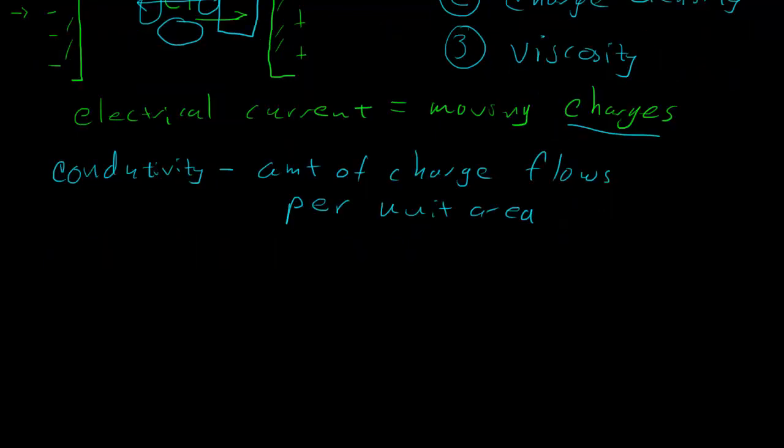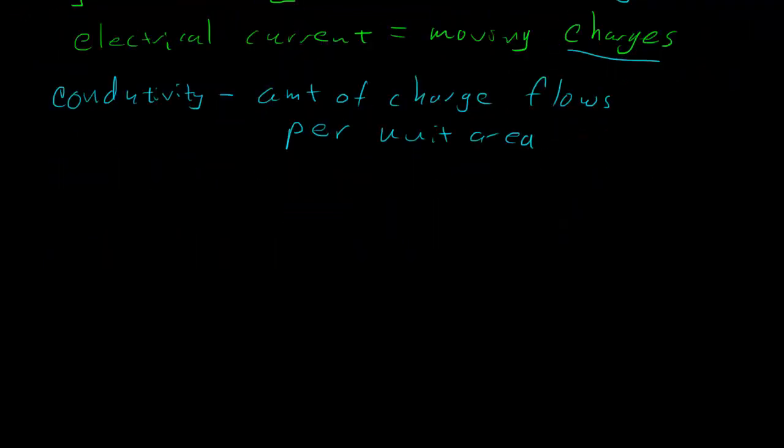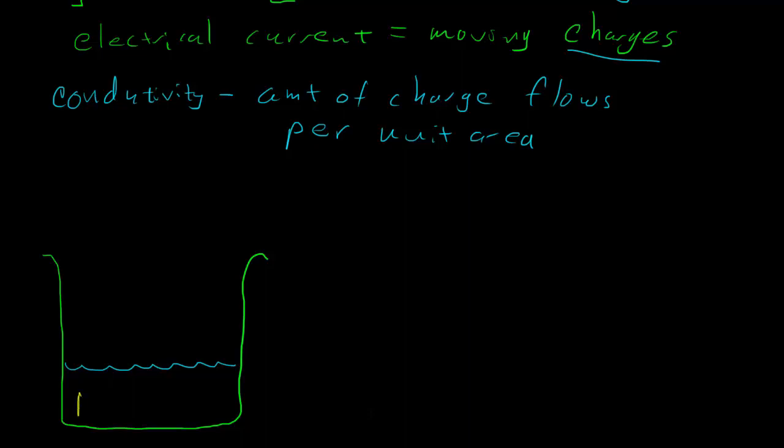So as we are doing this titration, let's think about what happens. I'm going to draw a couple of different beakers here, showing the situation at different points in our titration. Initially in our beaker, we've got our sample solution, and we've measured out a fixed volume of it, and inside this solution we've got some ions. If this is salt water, then maybe we have some sodium cations and some chloride anions. Now the chloride is what we're looking for. I'm going to draw a couple of them in here, and a couple of sodiums, since we always have a counter ion to balance out the charge. All right, so this is our initial situation.